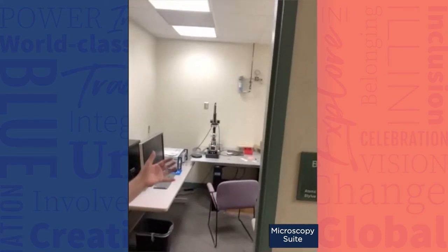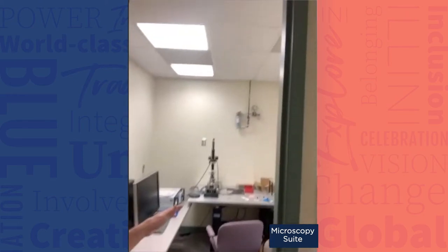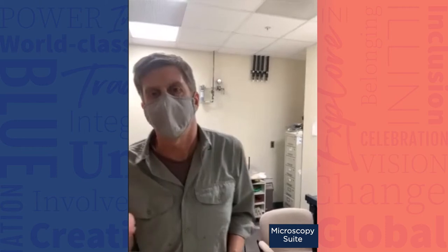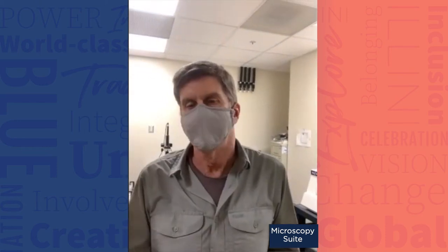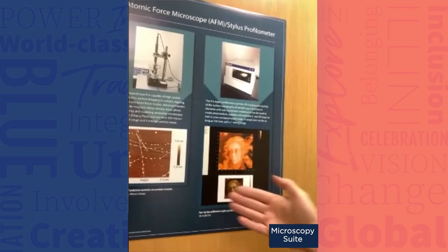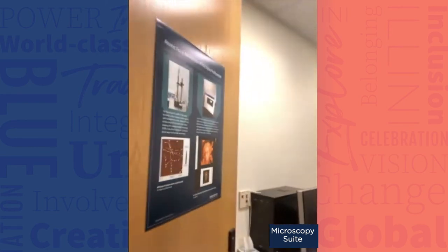This is atomic force microscopy — straight-up AFM. We also have this thing that looks like a pizza oven in here: it's a stylus profilometer. The stylus profilometer is kind of like an AFM except it has much better amplitude range, so for example you can put a coin in there and see the surface of the coin — something AFM could never handle due to the depth. This is a 10-cent euro coin from 2006.